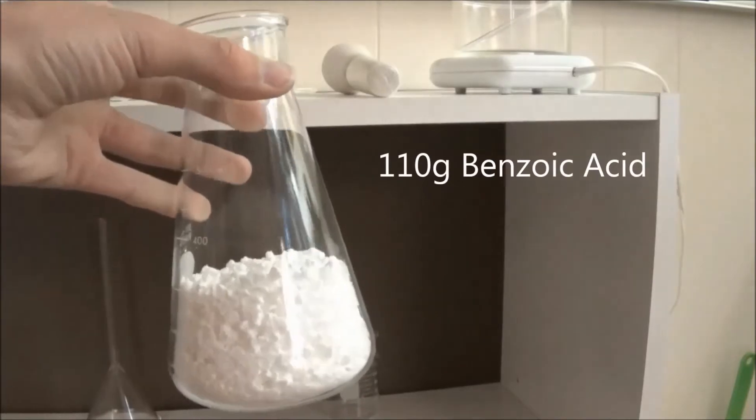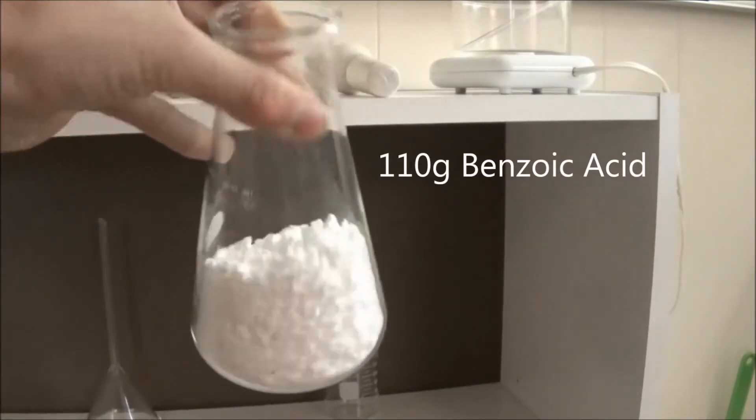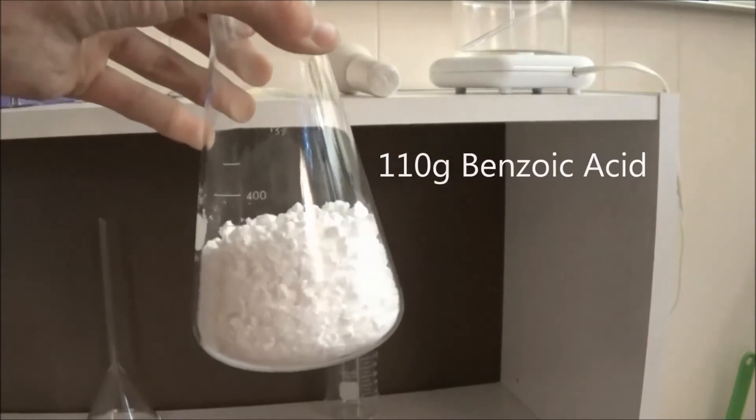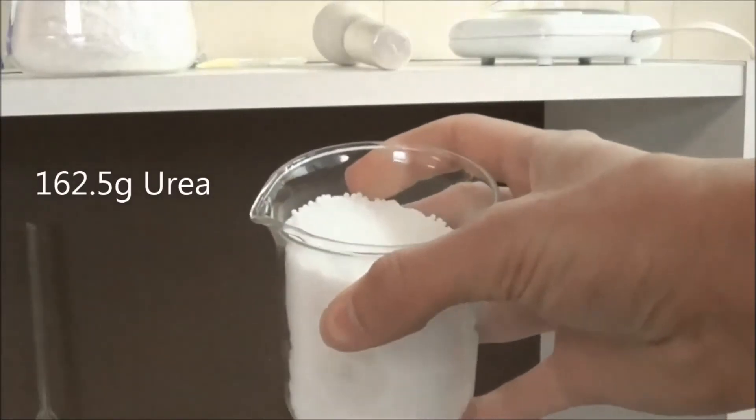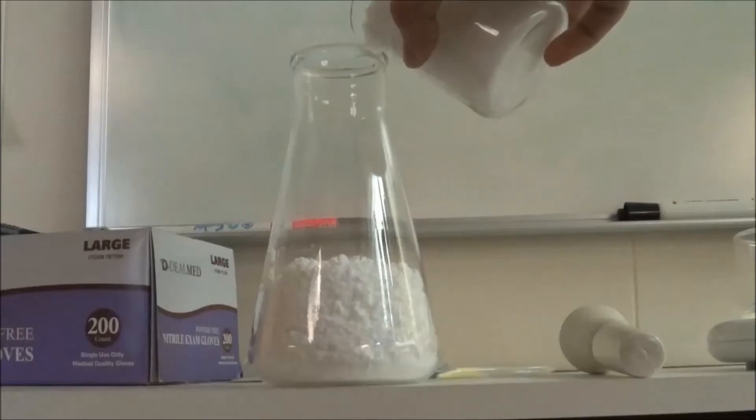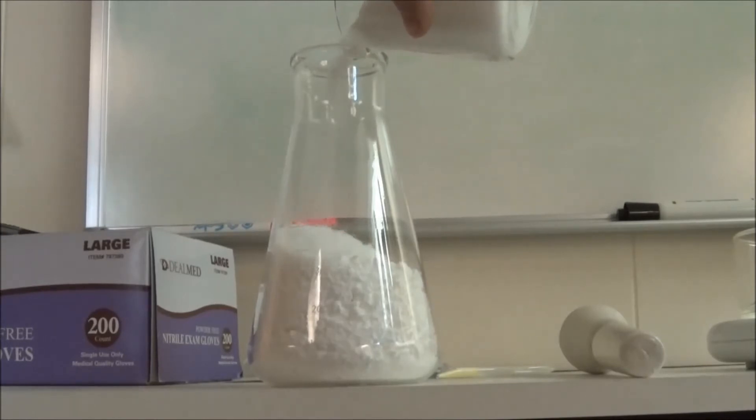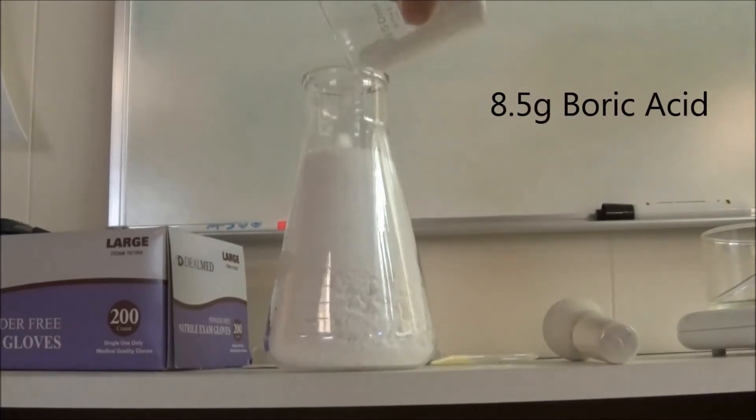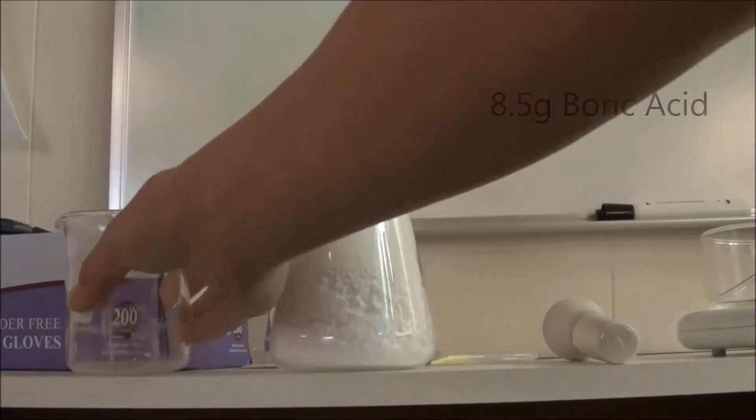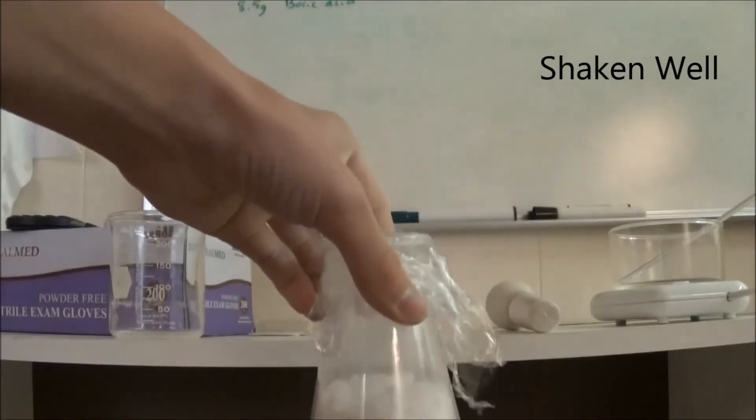I started off with 110 grams of benzoic acid. To this, I added 162.5 grams of urea. The final ingredient was 8.5 grams of boric acid. It was then shaken well to mix the reactants evenly.